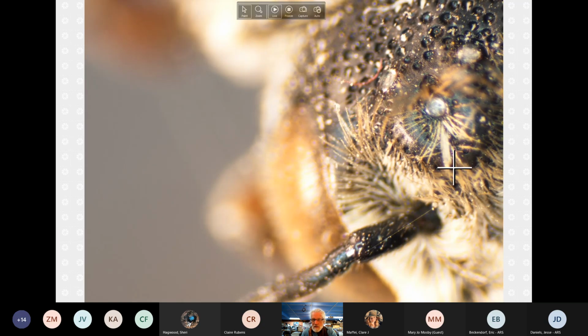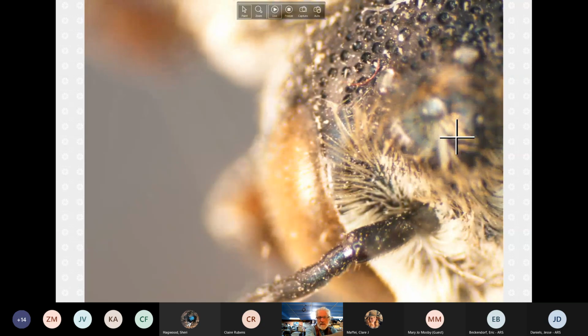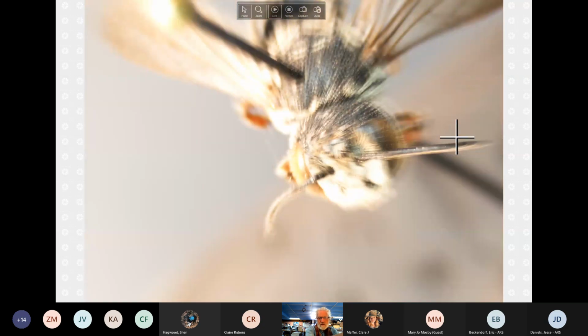It's hard to tell with the hair, but it seems to present, at least in this specimen, as a much narrower gap with pits going into the center. And then something is going on back there, I'm not sure, but also coming in from the rear. So those would be the main features between two tricky to ID things.